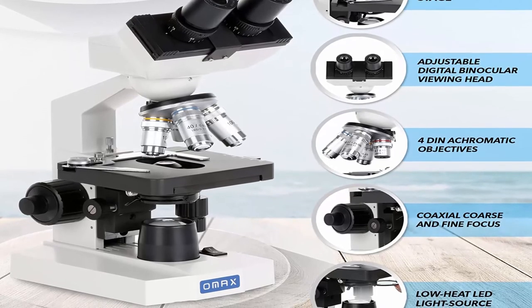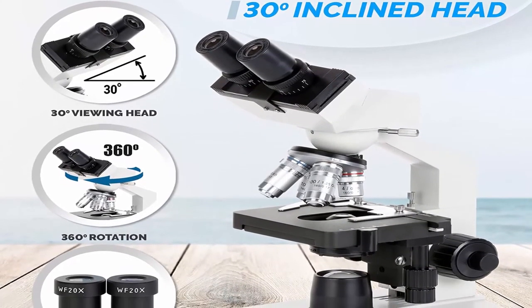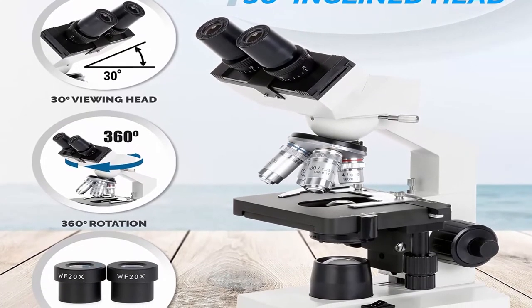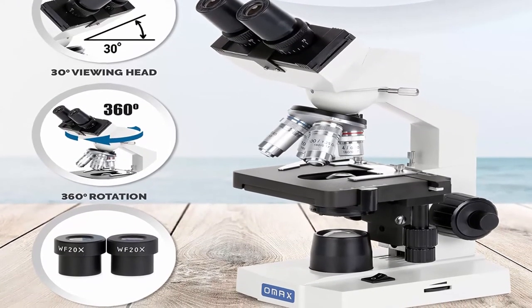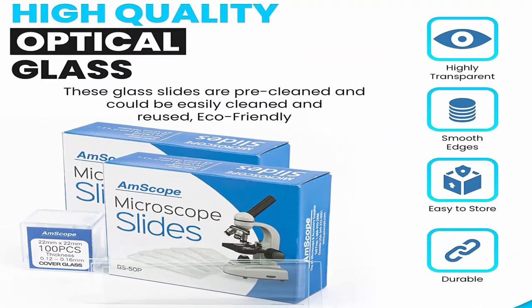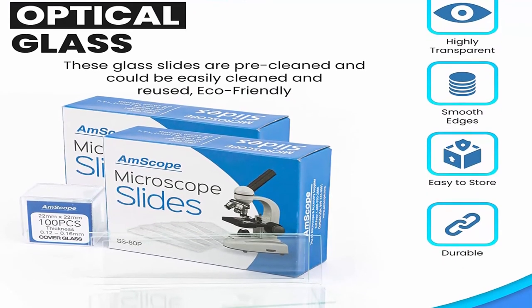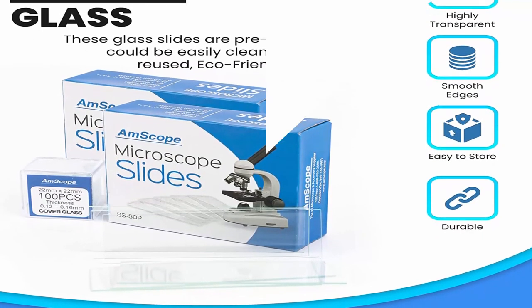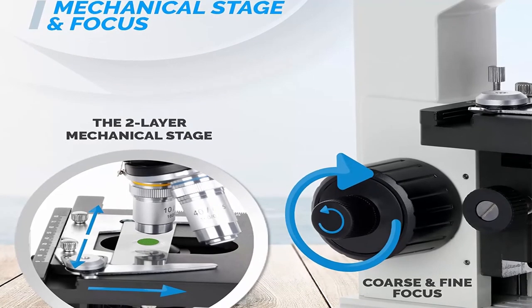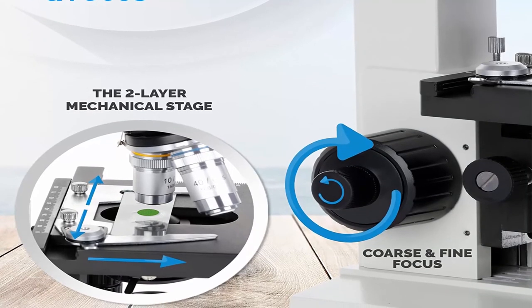Eyepieces: wide-field WF10x and WF20x. Objectives: achromatic DIN 4x, 10x, 40x spring, and 100x spring oil immersion. Viewing head: 45-degree incline, 360-degree swiveling binocular with sliding adjustable interpupillary distance of 55–75mm. Ocular diopter adjustable on both eye tubes. Nosepiece: revolving quadruple. Double-layer XY mechanical stage with scales, size 115mm × 125mm, translation range 70mm × 30mm.